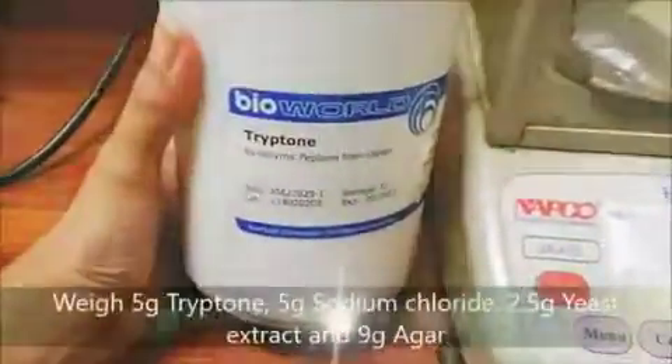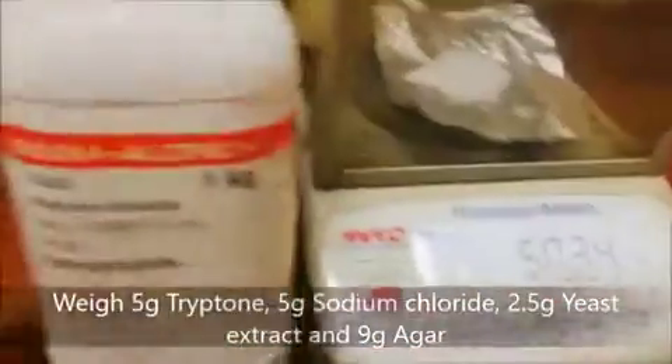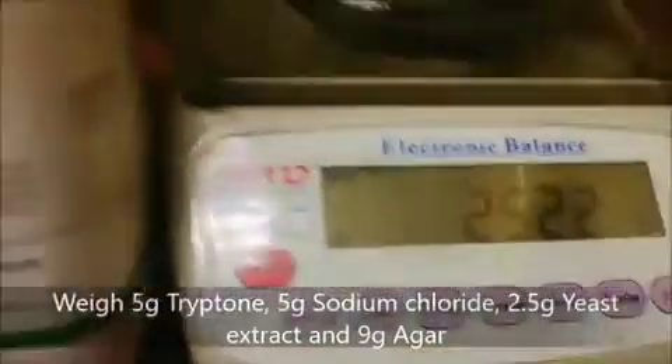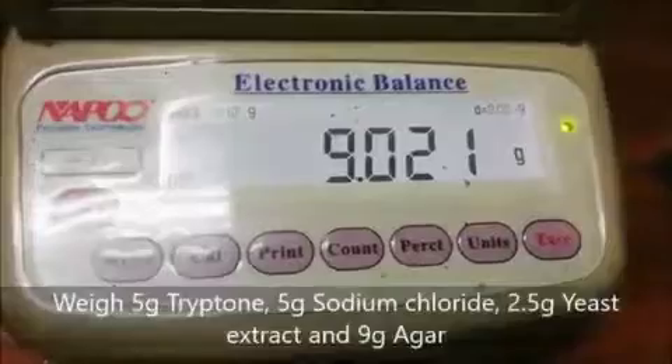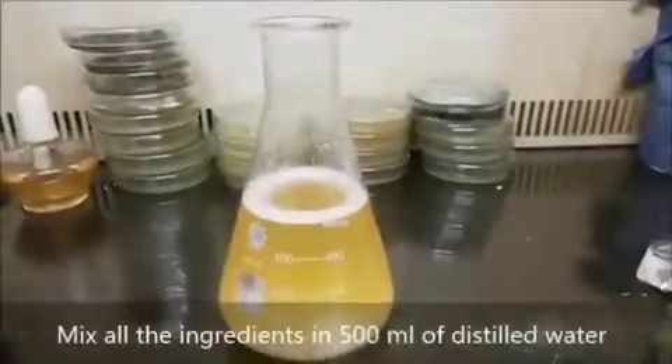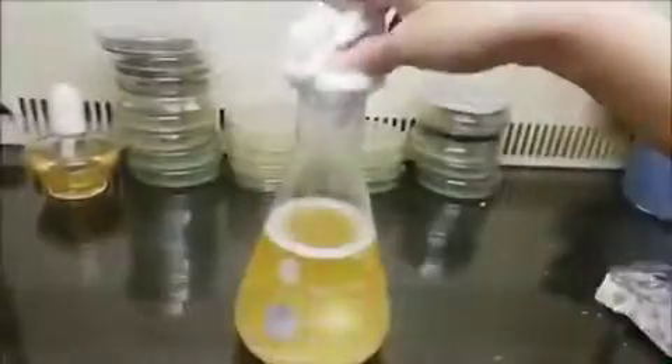First of all, weigh 5 grams of tryptone, 5 grams of sodium chloride, 2.5 grams of yeast extract, and 9 grams of agar, and mix all the ingredients in 500 ml of distilled water.